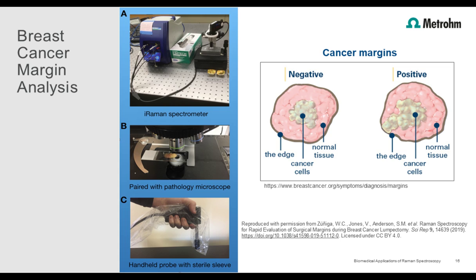And so in their experiment, they measured with two types of portable Raman systems, one with a 785 nanometer laser and one with a 1064 nanometer laser, because they were worried about fluorescence with the 785 nanometer system. They were also able to sample using a variety of setups, as you can see in the pictures shown, using the fiber optic setup to measure in a variety of ways.